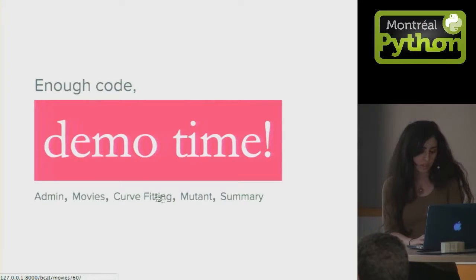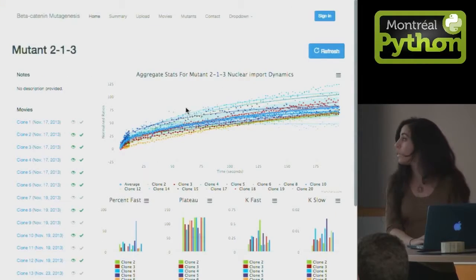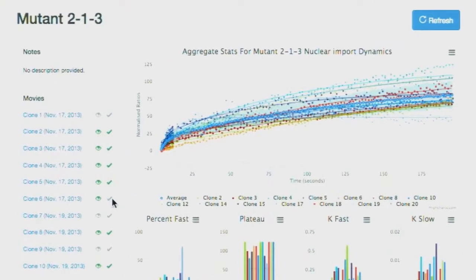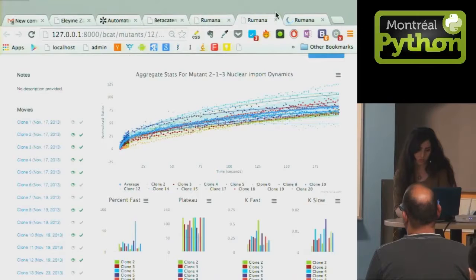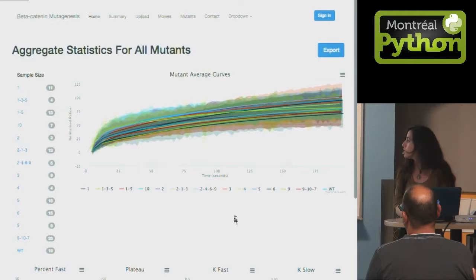One other cool thing is that I can also analyze data in bulk. So I can use all this data and aggregate it and have a nice visualization out of it. Also, I can set things as invalid, like this one. I don't want it, so I refresh it. Also, this one. Yeah, this is another example of a summary kind of graph.